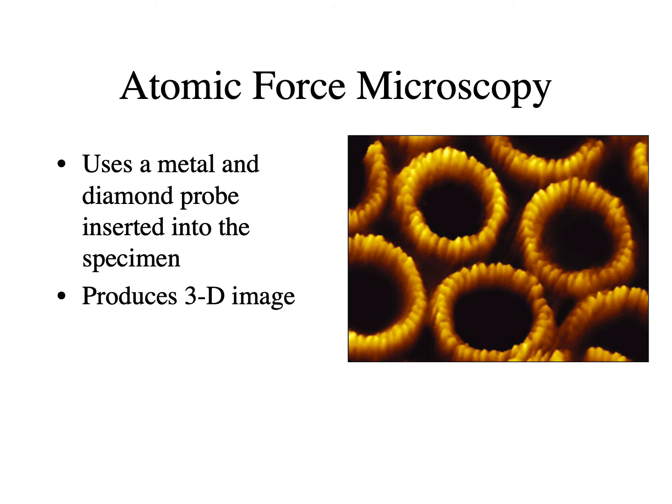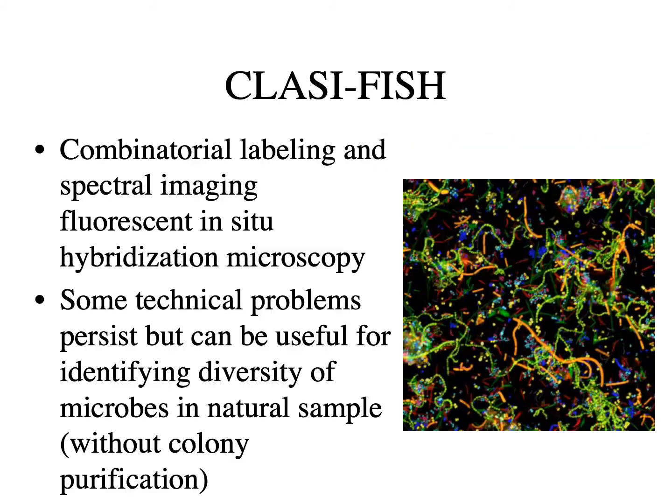Atomic force is very similar. It's just a diamond tip, and diamonds are hard. So the big problem with this type of microscopy is you don't know how your tip is staying sharp. If it's gotten dull like a pencil, you're not going to get the same result, which is why this is still kind of a very theoretical type of microscopy. But this basically uses a diamond instead of metal, and it gives you just these beautiful three-dimensional images. A little more pricey though.